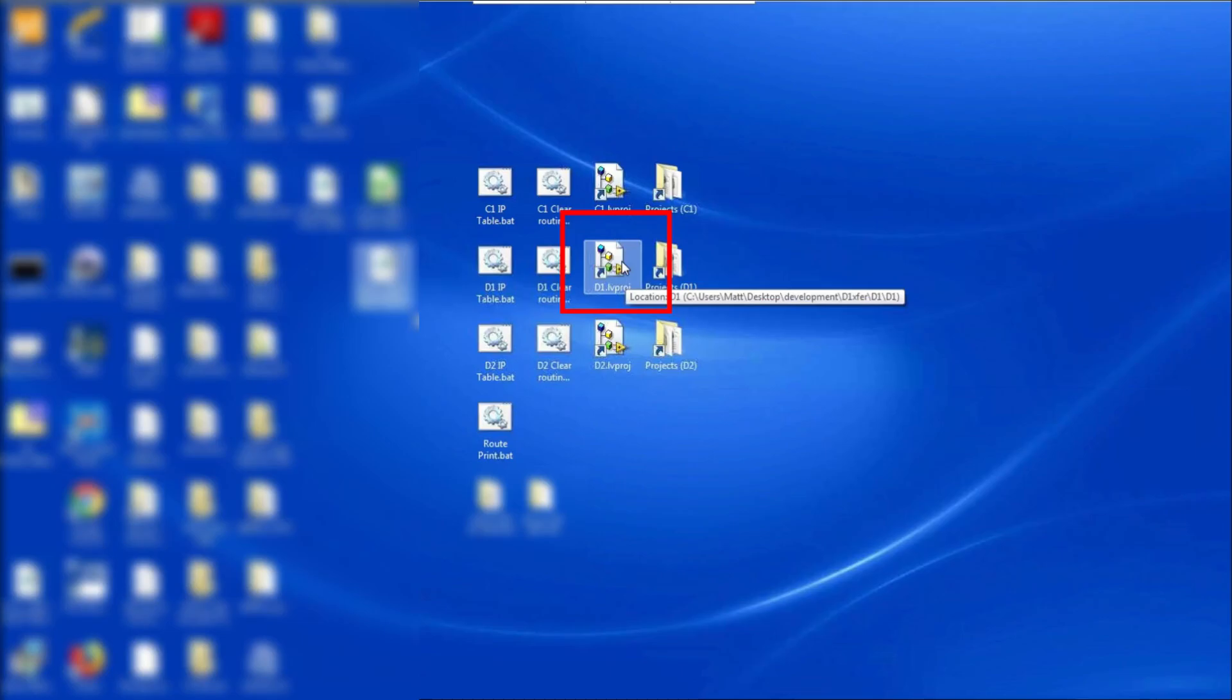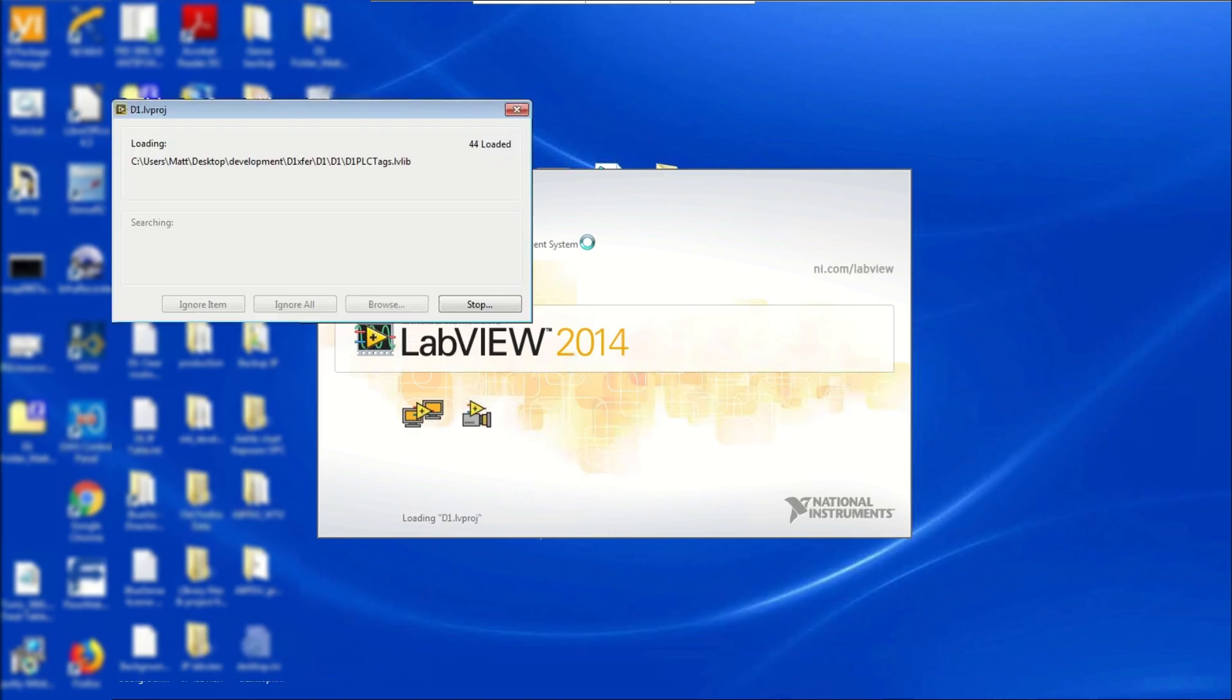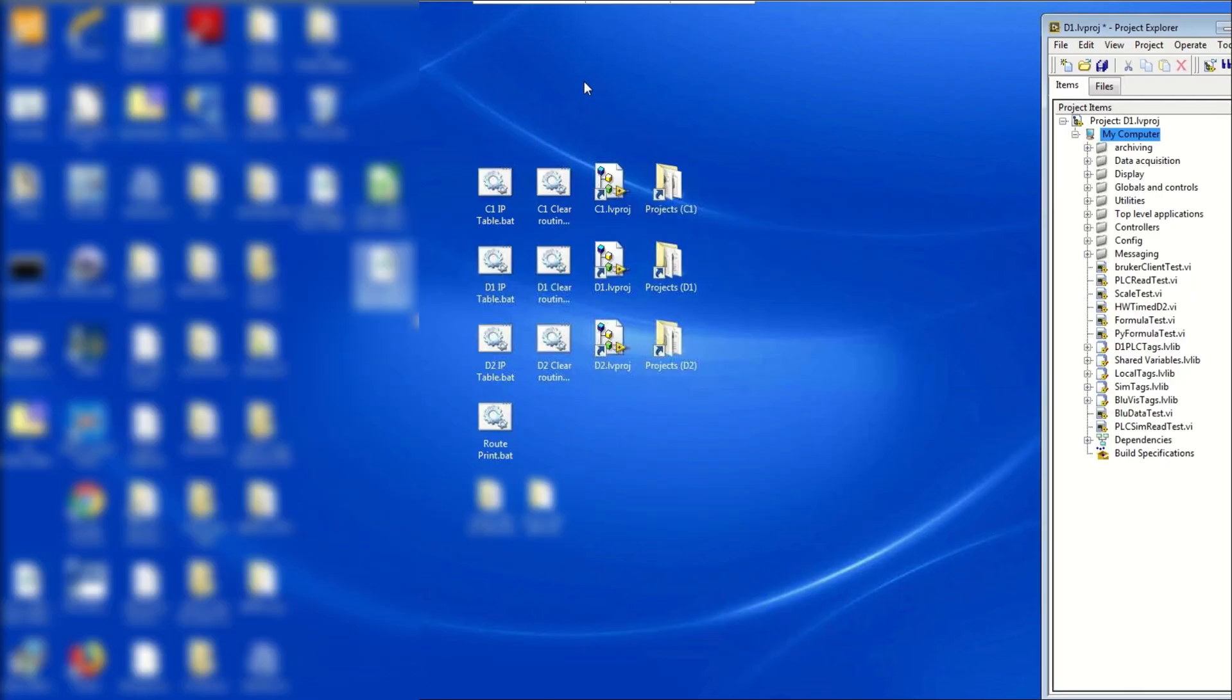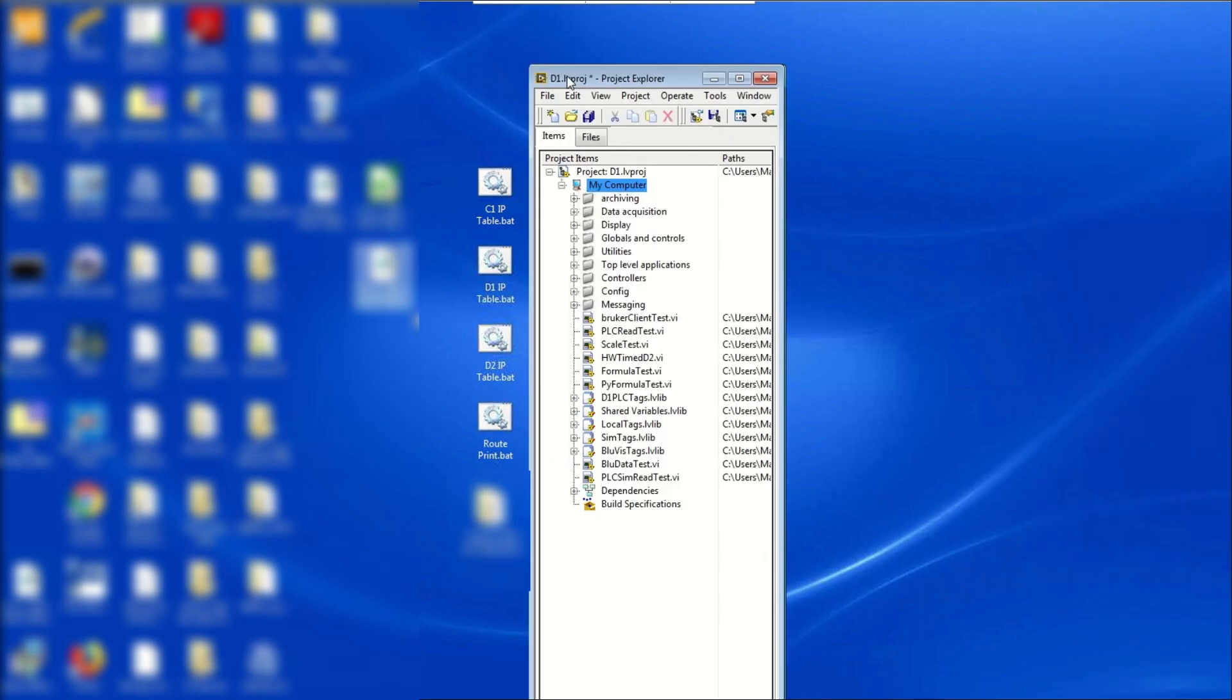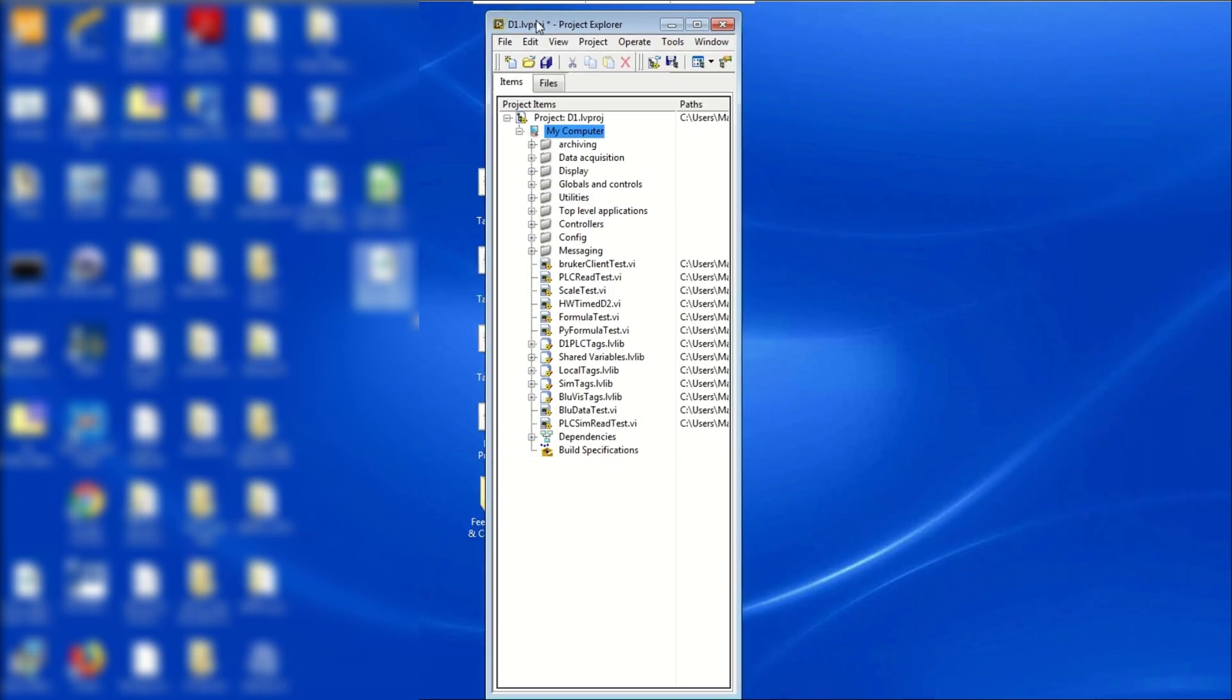Once the connection is established, double-click on D1.lvproj to open Project Explorer. A vertical rectangular folder will then appear. In this Project Explorer folder, deploy all 5 .lvlib files. These files are named D1.plc tags, shared variables, local tags, sim tags, and bluevis tags.